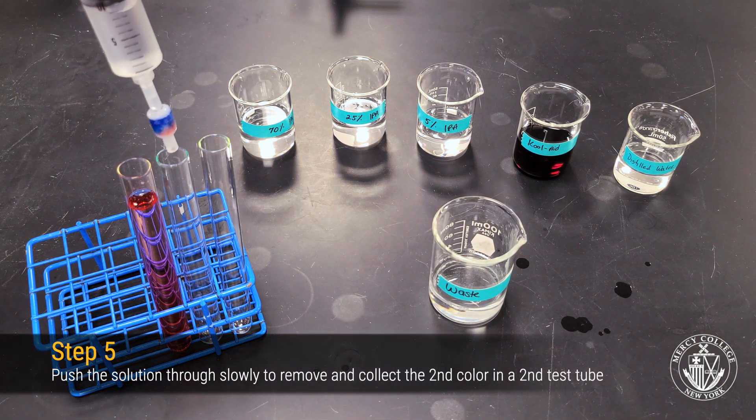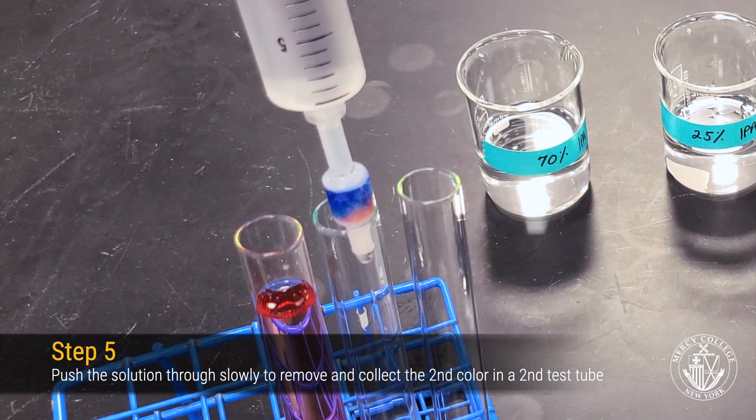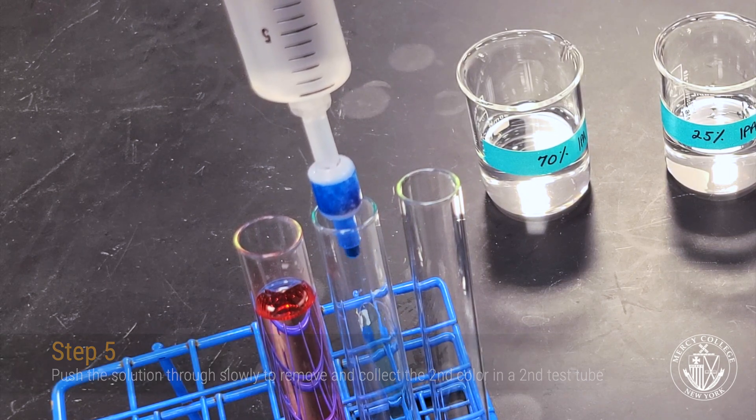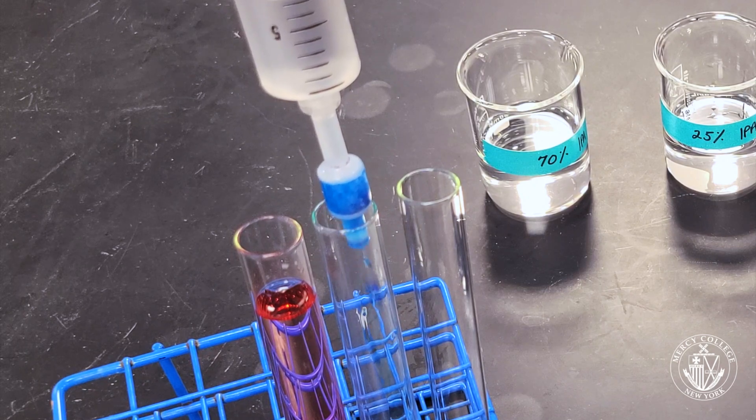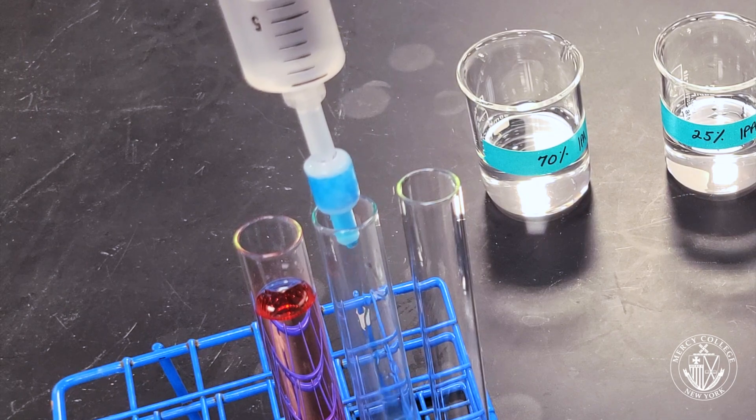Slowly push the 25% IPA solution through the column in order to remove the blue dye. Continue collecting the elutant until you've fully removed the blue dye from the column. Proceed slowly as you push liquid through the column, being careful not to apply too much pressure or to damage the column.